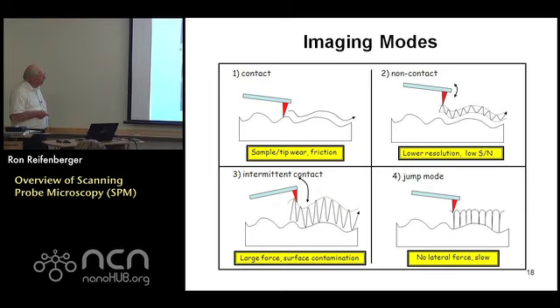And then this example, this is a friend of mine from Spain. He imaged a DNA molecule. So he put a strand of DNA on a substrate, and he imaged it, and he actually took the tip and he cut the DNA right here. So you can see it goes back. It just shows you that you can manipulate. You can actually start to tailor strands of carbon nanotubes or DNA molecules by using the tip to perform some nanomanipulation. So just a few examples.